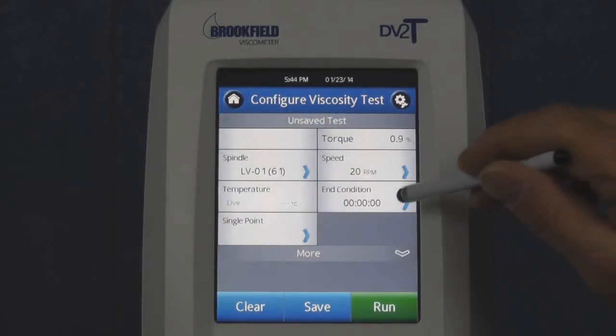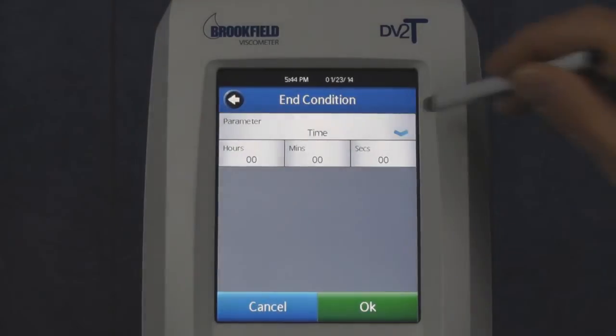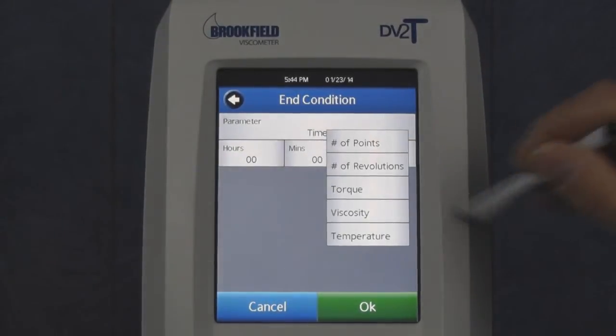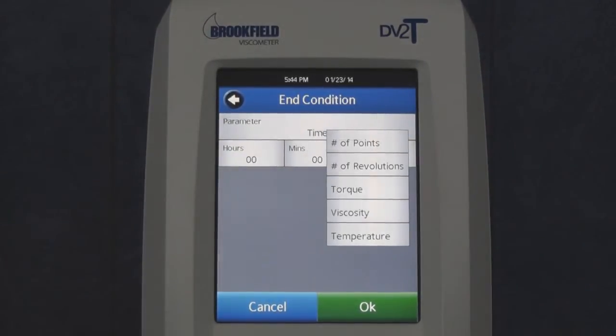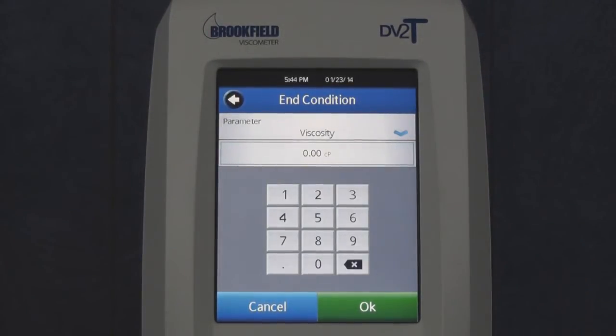When viscosity is selected, the test will complete when the specified viscosity value is measured.